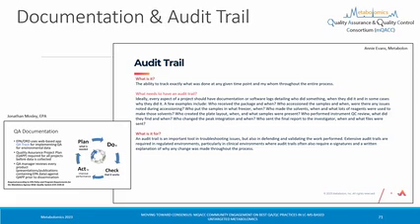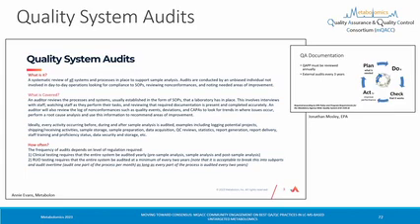Similarly, with audit trails, you may walk out and talk to your students and say, where's your notebook? I want to see your notebook. At an organizational level, the idea is this. And I love this particular word. Audit trail is important in troubleshooting issues, but also in defending work performed. So you can start to understand why formalized audit trails are important, because someone may come back and say, you provided a service, and I want to know exactly what happened, and the company may have to defend, right?